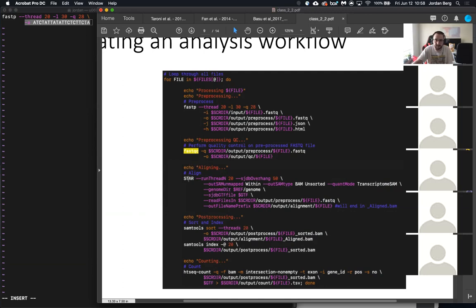So then moving forward, we would go to aligning. We would again provide that splice junction variable that we provided during index building, and this needs to match what was used when building the index in the first place. So if you were trying to run 50 base pair single-end sequencing on an index that was using 100 base pair splice junctions, they would be incompatible, and you would need to rebuild the index.